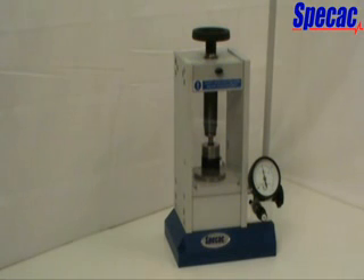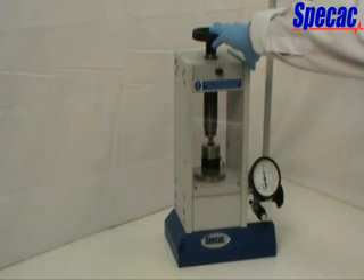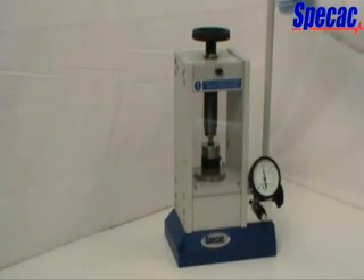When the required tonnage load is indicated on the load gauge, stop pumping. The tonnage load and pressure of oil in the system can be held for as long as required. You may observe a slight decrease in the tonnage load applied, indicated at the load gauge, with a decrease in the oil pressure of the system, as the work being pressed may relax over time. You can bring the oil pressure back up to give a required tonnage load by pulling gently on the pump handle grip further.